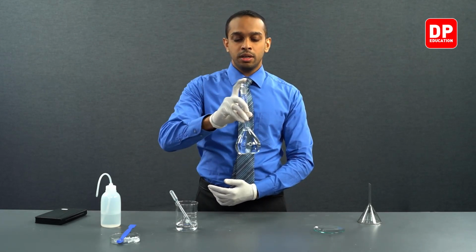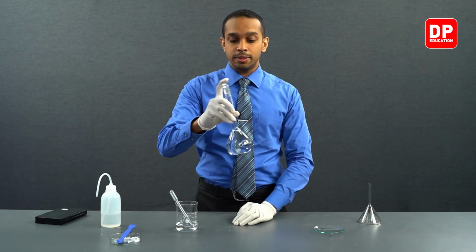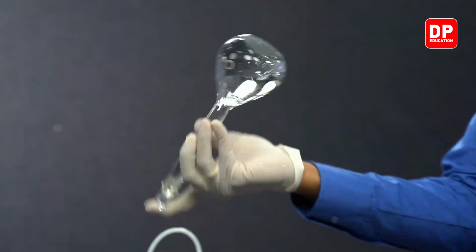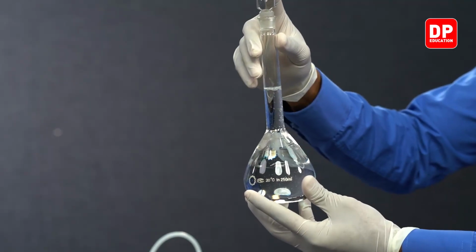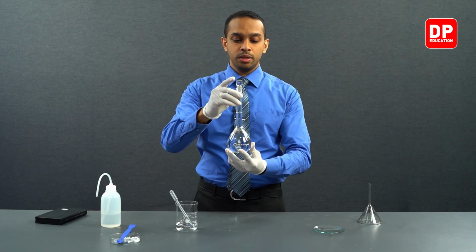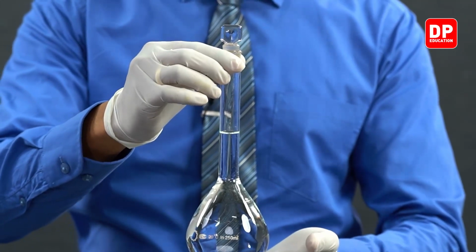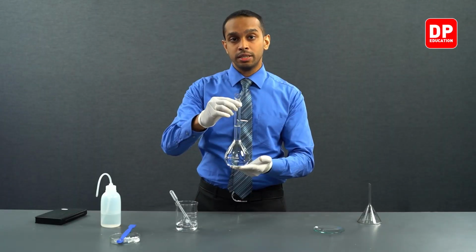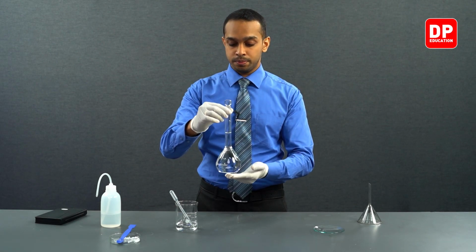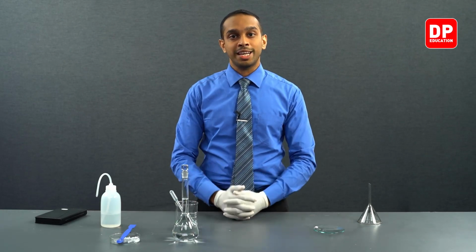You can do it a couple of times to make sure that all the contents are properly mixed. Once you have turned it upside down a few times, like so, you can be sure that everything in here is now properly mixed and you have prepared a homogeneous solution. So this is how we make our standard solution of potassium oxalate with the concentration of 0.02 moles per decimeter cube. Let's move on to our next step.